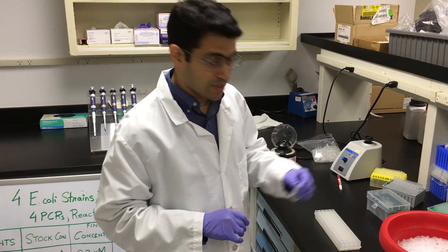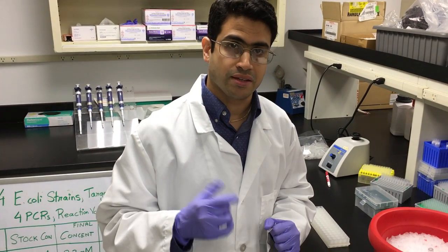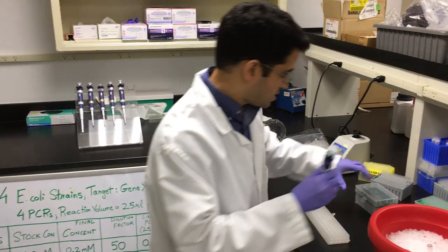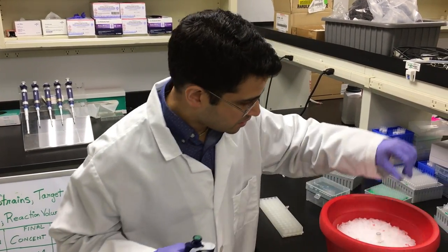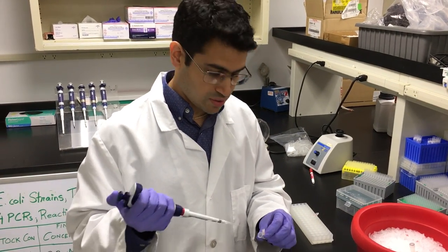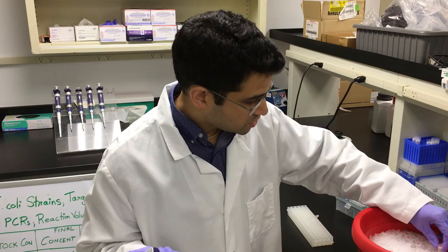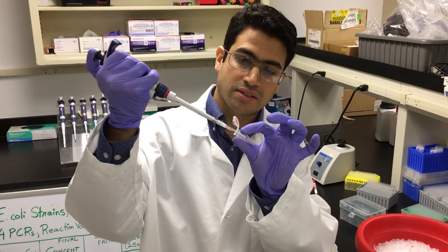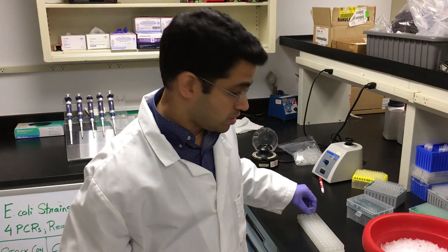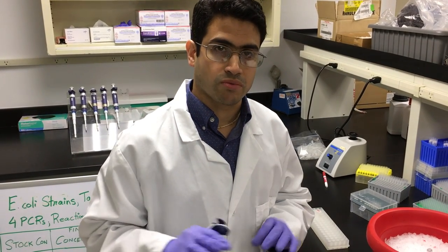We're now going to prepare our master mix — this is the tube I'm going to use. The first ingredient you should add is the PCR grade water. I've already calculated the volumes. I set the PCR grade water on ice as well, even though it's not frozen, just to keep everything at a cool temperature. After adding the water first, you can add any of the other ingredients in any order — it doesn't matter. Just make sure to add the Taq polymerase right at the end.